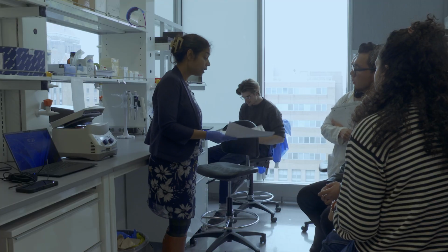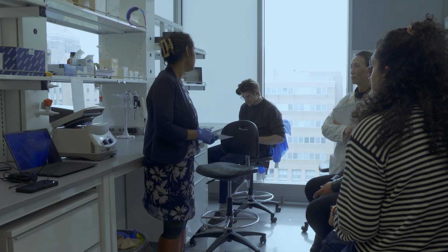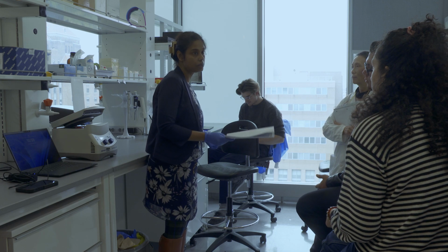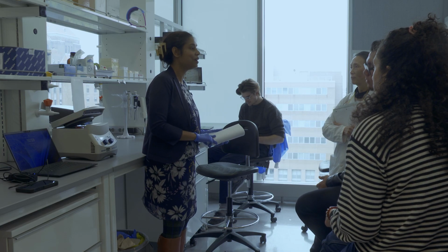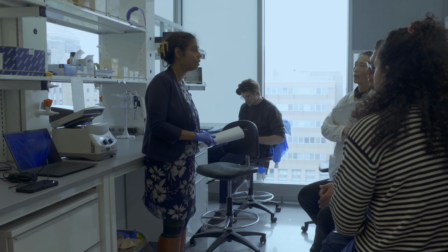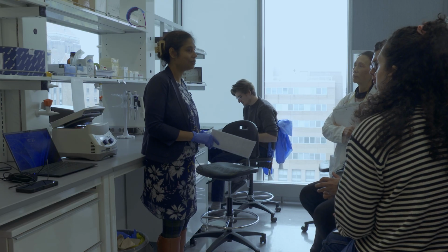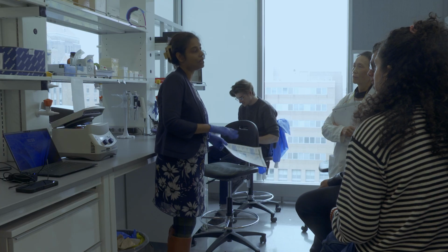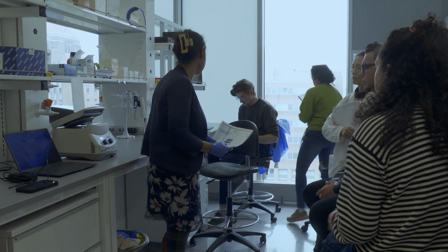So also, when we are doing the PCR, I'll go over the QC, what are the necessary QC you have to do before you decide to sequence any sample. I would never recommend skipping those steps, although it looks very straightforward, those are very important. It's NanoDrop, Qubit and TapeStation, but always do those.